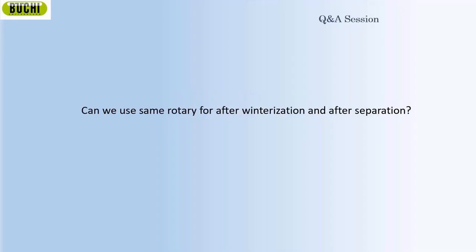Thank you very much. And can we use the same rotary evaporator after winterization and after separation? Yes, that's correct. You can use the same rotary evaporator after winterization and after separation. But if you want to do the winterization and the separation evaporation at the same time, it is better to get two different 20-liter or 50-liter rotary evaporators, so you can run them at the same time smoothly. Great, thank you.